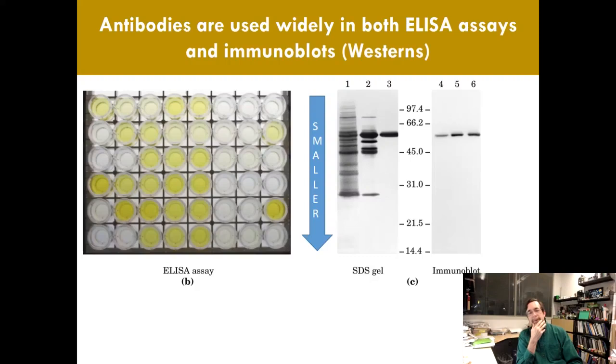And this is what the results look like. The ELISA assay, the 96 well plate, is shown on the left, and you can see whatever the antigen was that the primary antibody was binding, the yellow spots have more of it. And so you do 96 experiments, and you put them all together. Usually you do experiments in a line. You draw a line, you see how much stuff you have. This tells you by the colors how much binding you have to the bottom of the plate.